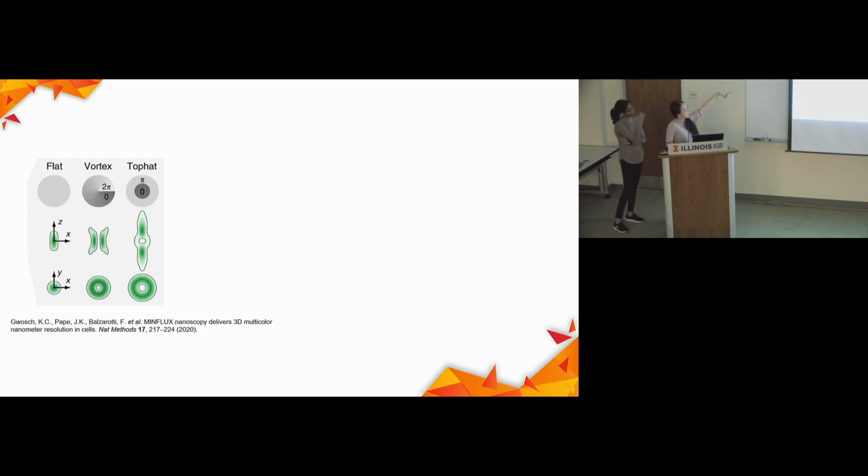The first one is a standard, it's not the donut shape. The second one is how you create a donut shape in 2D, how it looks from the side, how it looks from the top. This is how the 3D donut shape looks. So if you cut from the middle, it's also going to look like a donut. But if you look from the side, it has a hat on the top and a hat on the bottom, and has a space in the middle.